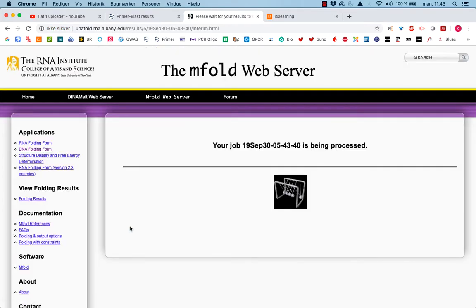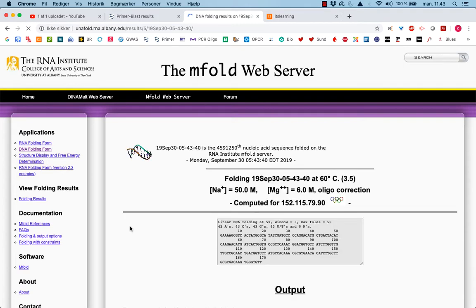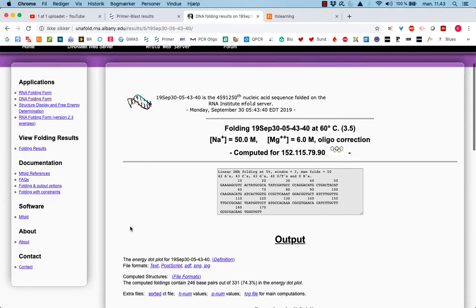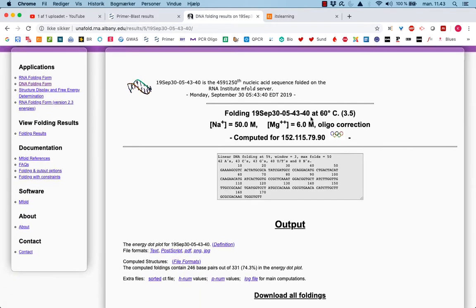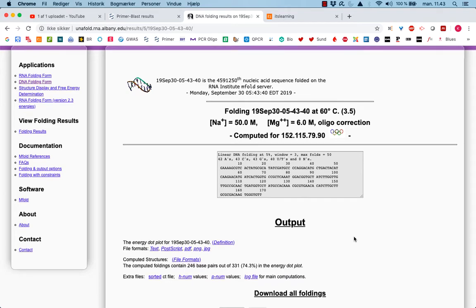And it will take a while. Sometimes a little faster than the others. And now we got it. Tells us the concentrations, that's fine.